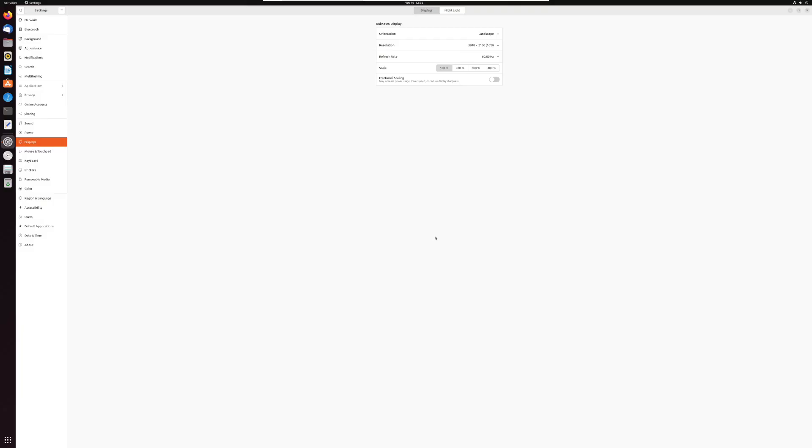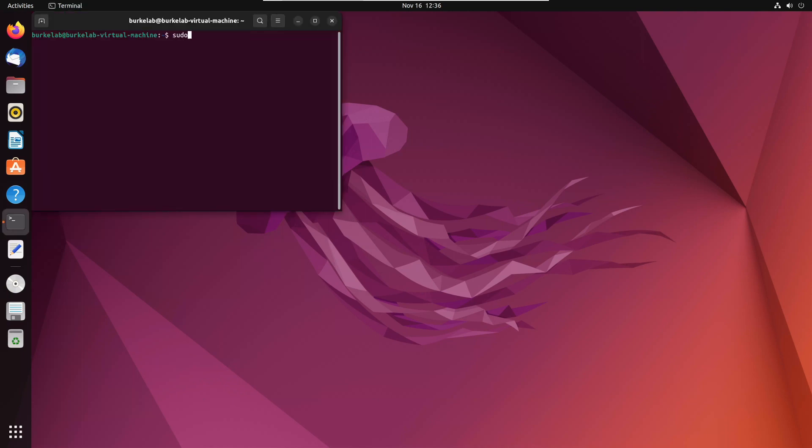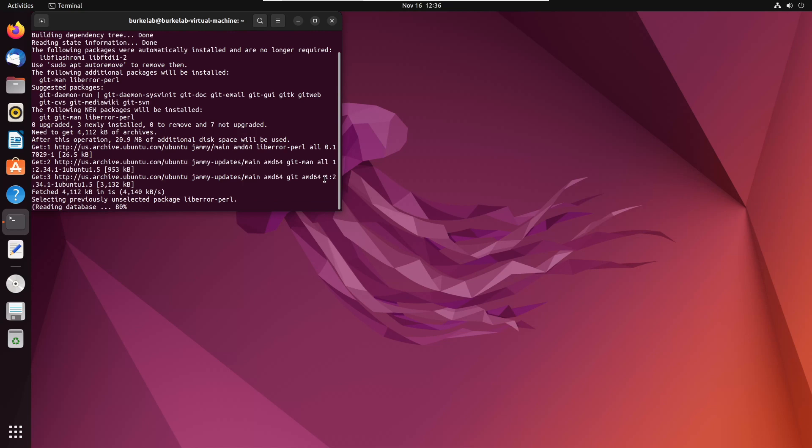You can do this on a regular computer if you want. The installation is complete. We're going to need Git, which is the program that allows us to transfer the software that's already on GitHub, so we install that here.